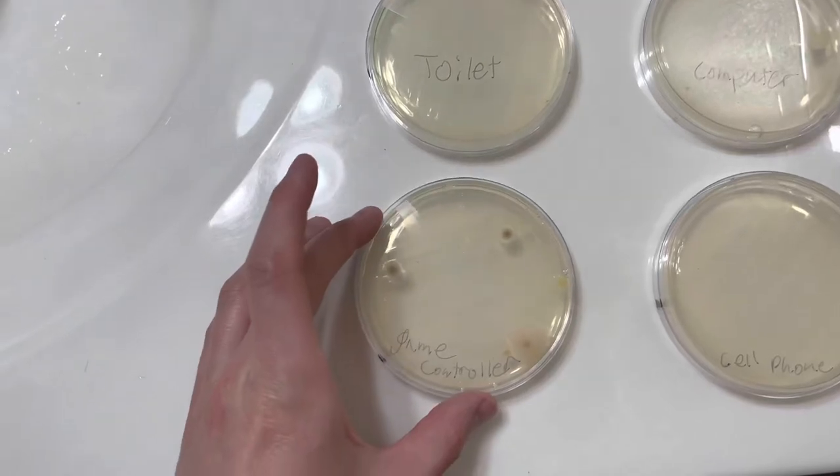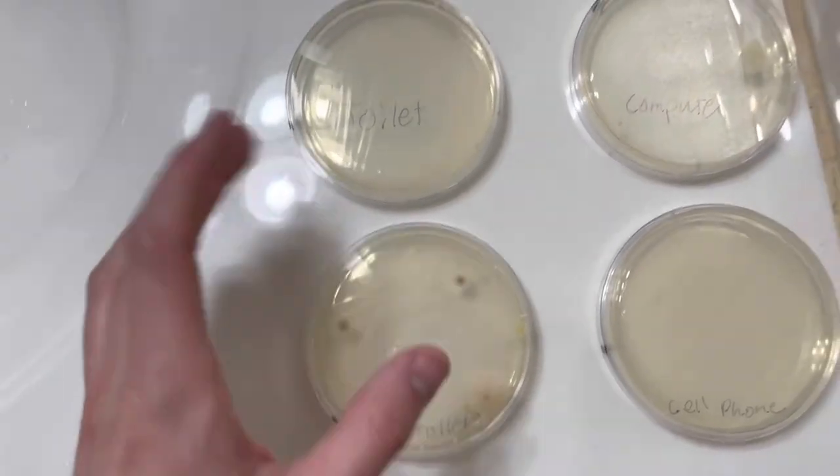By far the worst had to be that bathroom floor. Then after that would have to be the game controller — that is disgusting. Although I didn't show all of them, I only showed the worst of the worst. Some of them didn't have anything at all, so I decided not to show those just to save time. But that was actually crazy. The bathroom floor, the game controller, and the computer were all by far the worst of any of the different surfaces we grew them on.